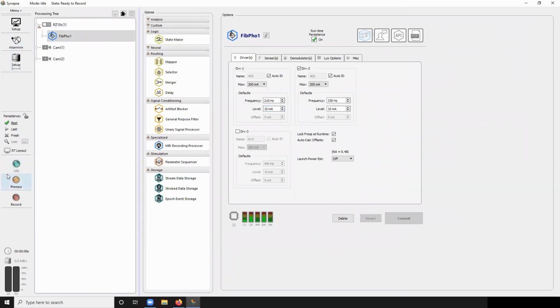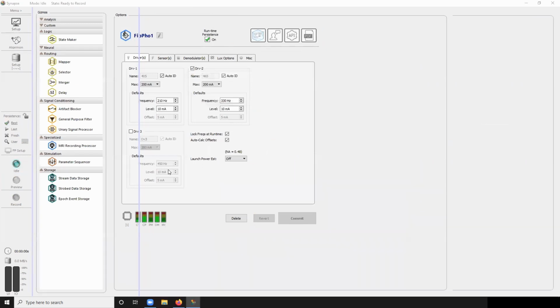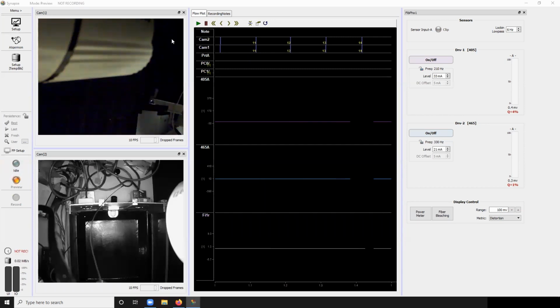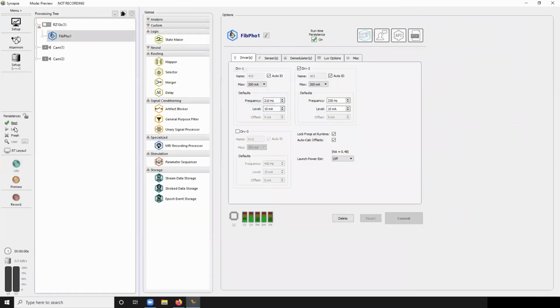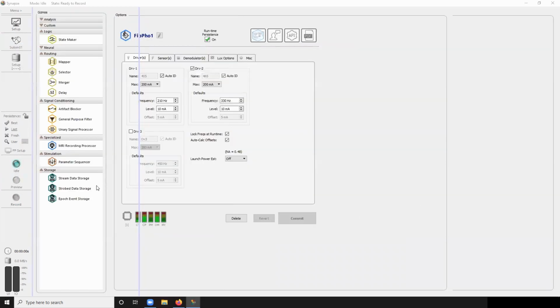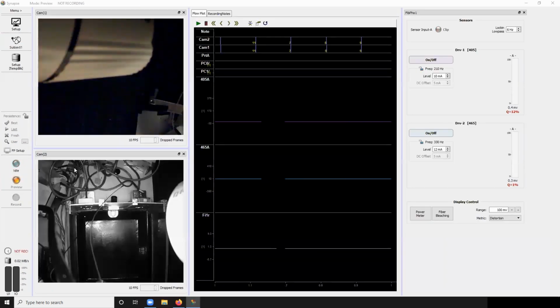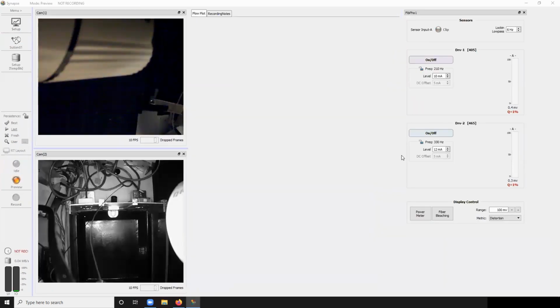But let's say I go back to Algernon, what's it going to be? Well, it better be 33 and 21 because that's the last known setting of Algernon under the experiment setup, which it is. So that's what the best persistence does. If I pick last and go to subject 1, it's going to be 33 and 21 because that's the last known runtime setting. Okay, it did 10 and 12.